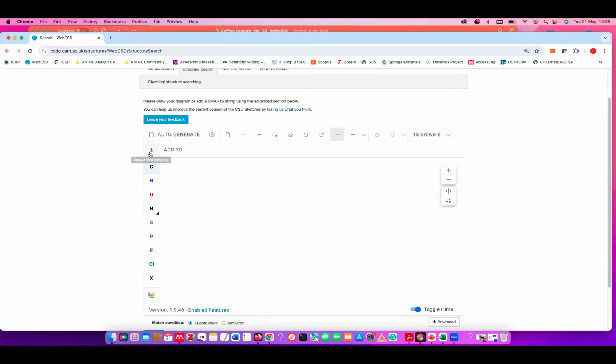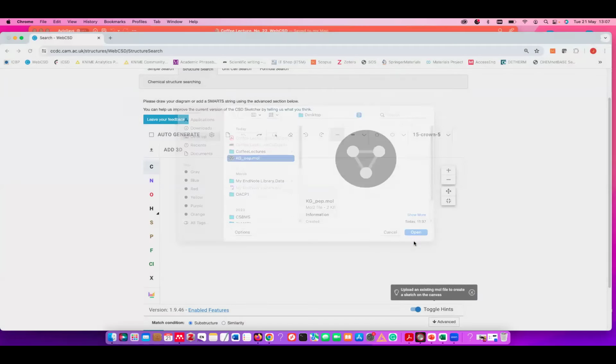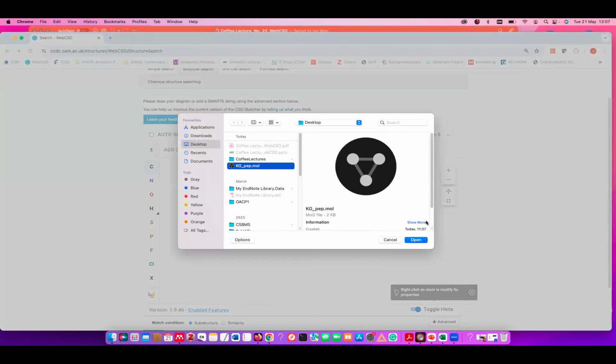Now, for today, since I don't have so much time, I've prepared a template already. If you have a molecule drawn with ChemDraw and you save it in a mol file, you can then easily upload that. So here is something, a peptidic fragment, I would say. So I have it here now. Let me click somewhere else. Oops, no, wrong. I'm sorry, I clicked the wrong button.